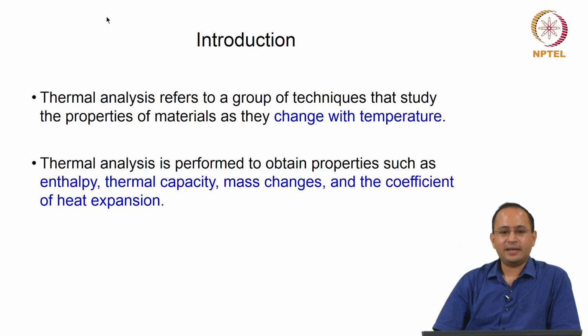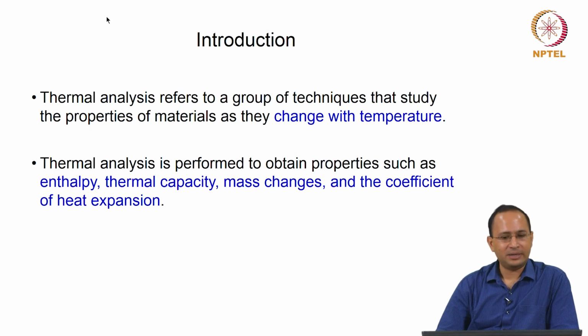So basically thermal analysis refers to a group of techniques which study the properties of materials as they change with the temperature. So the focus is on the temperature. As you are changing the temperature, how the properties are changing, right? For example, any material, if you heat it up, the temperature goes up, right? But beyond a point, there might be a change in phase. Simple example, ice. Ice will turn into water at 0 degree Celsius, and then that water will evaporate at 100 degree Celsius, right.